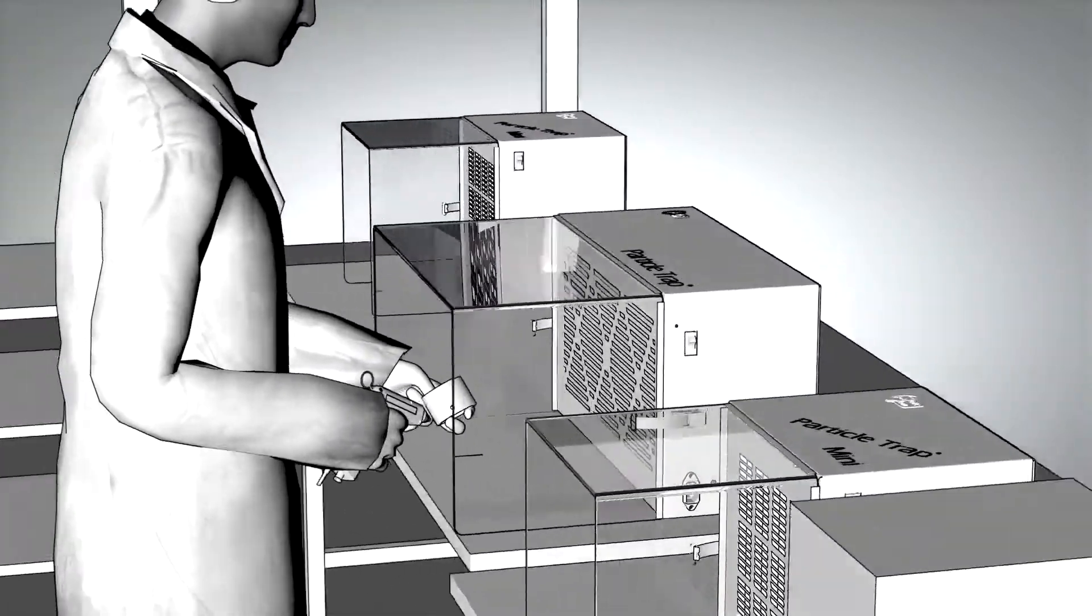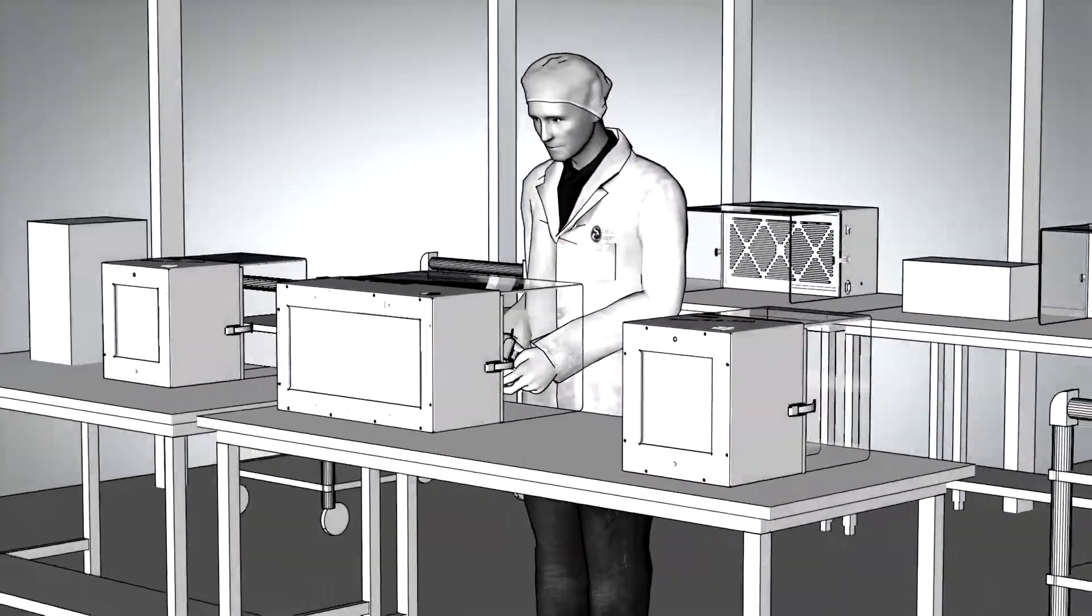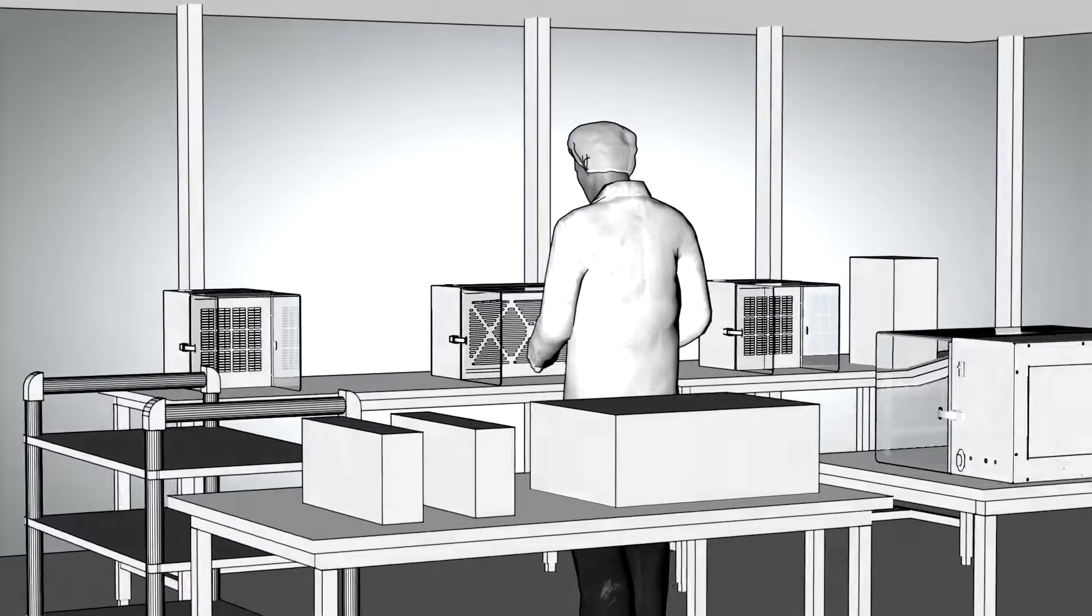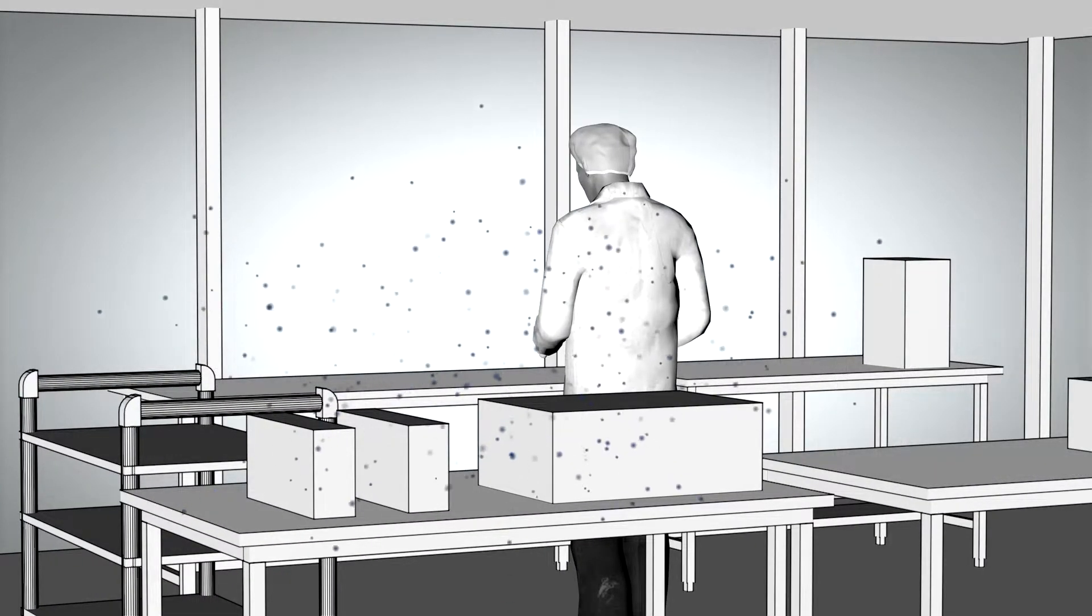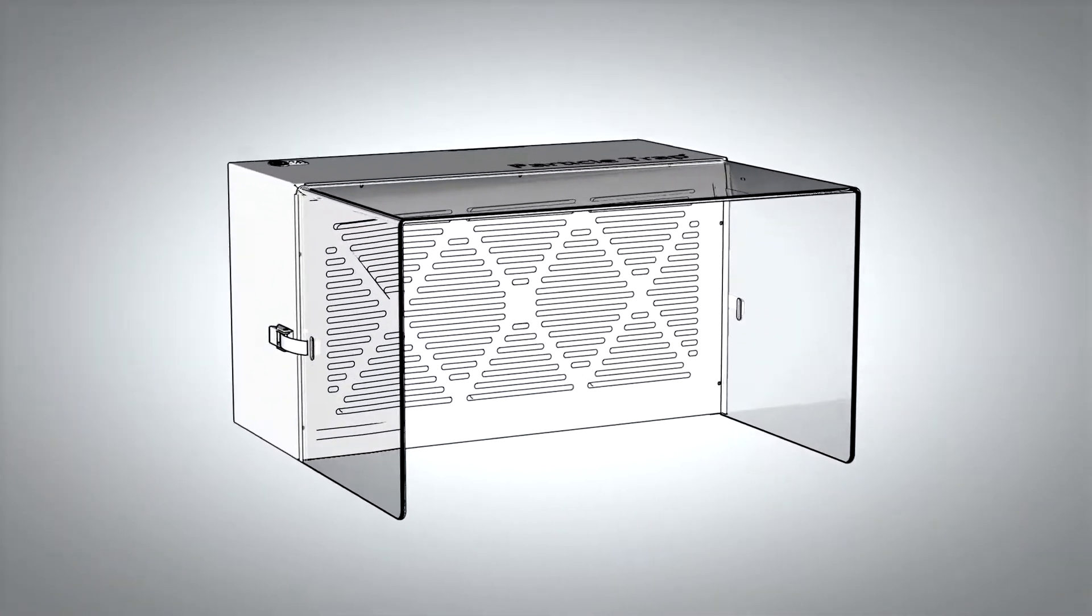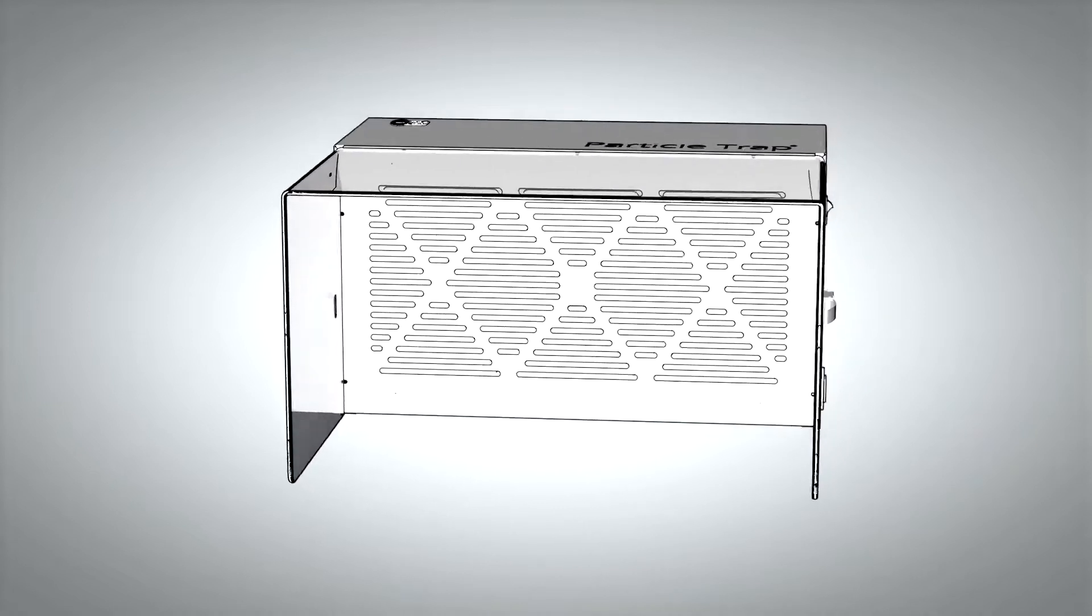Our static clean particle trap is a versatile particle capture system that answers an age-old question every clean room with an air gun faces: where do the particles go? If the answer is everywhere, we can help. Introducing our most advanced, compact, and affordable particle trap.